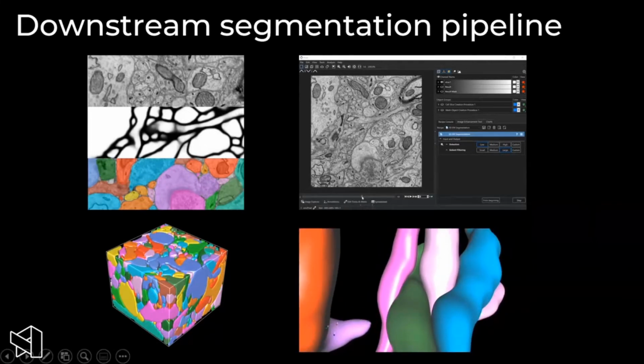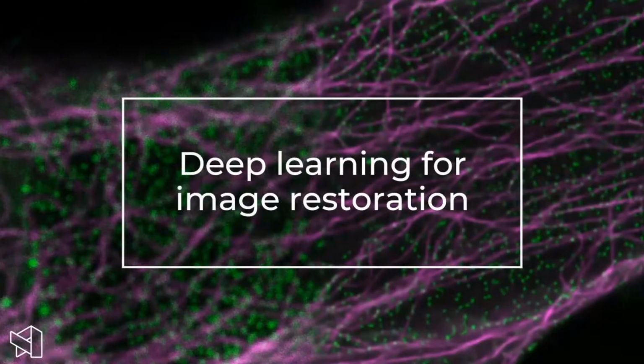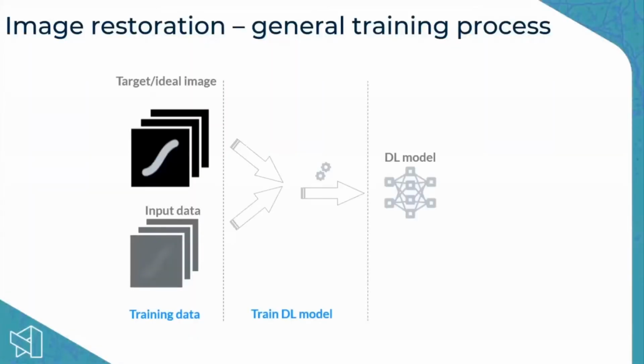Another application we have for deep learning is image restoration. This is a project that we started a little bit over 2 years ago, and relatively quickly we partnered with Hari Sharoff and Gigi Chen from the NIH, as well as a few others were added, but also with Hu Zhao from Texas A&M, and we now have several examples. I'll show a few of them.